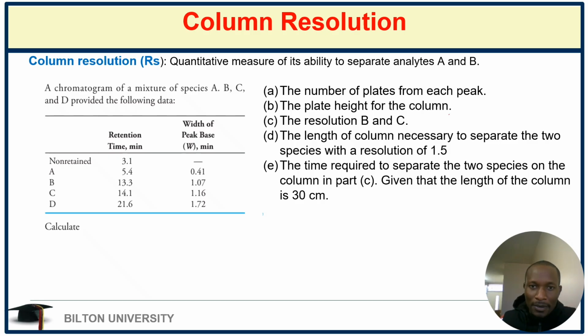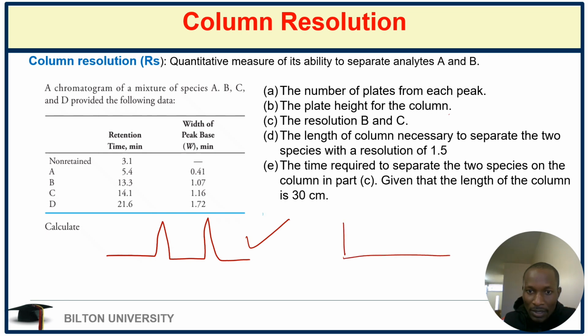So now, during separation in chromatography, the aim is to have a better separation between solutes in the mixture, such that if, for example, this is our solute A, you have a peak that can look like this. This is a proper separation. But if you have a peak, let's say this is your chromatogram, and you have something like this, this is not a proper separation, so it means that something needs to be done in that case.